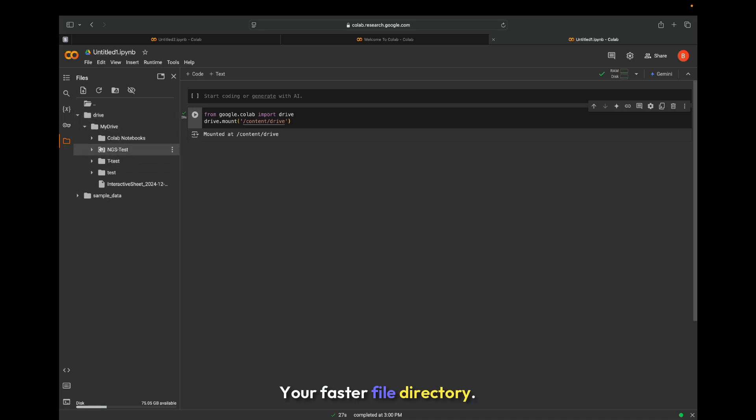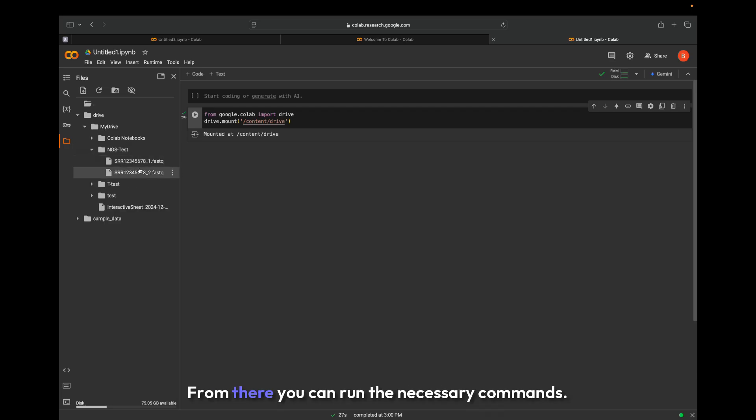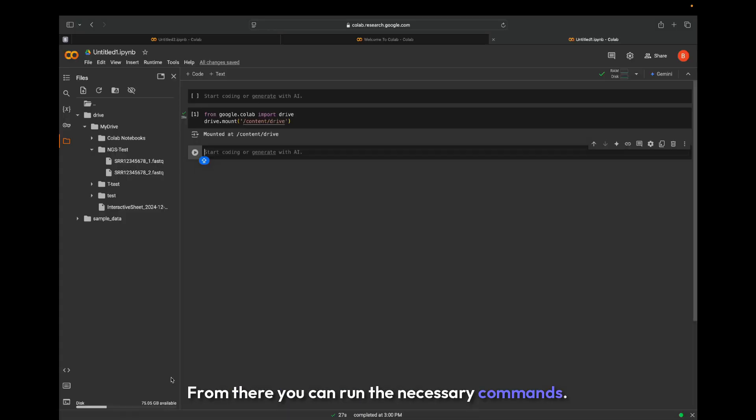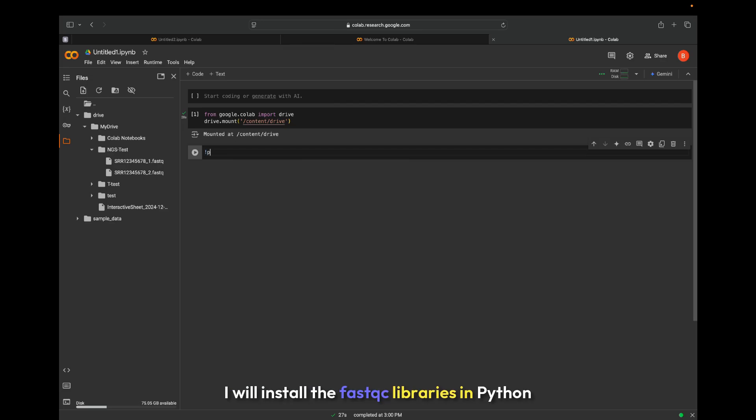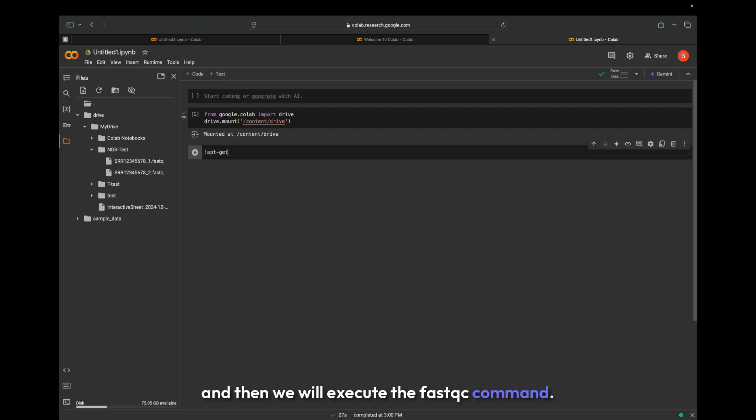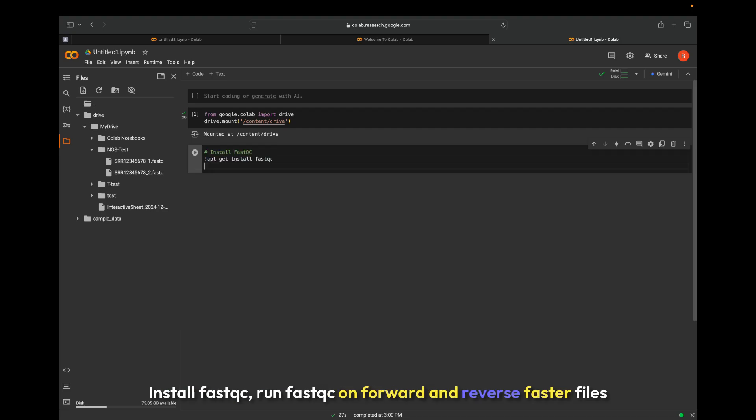From there, you can run the necessary commands. First command, I will install the FastQC libraries in Python, and then we will execute the FastQC command: install FastQC, run FastQC on forward and reverse FASTQ files.